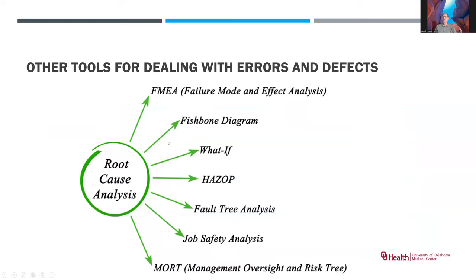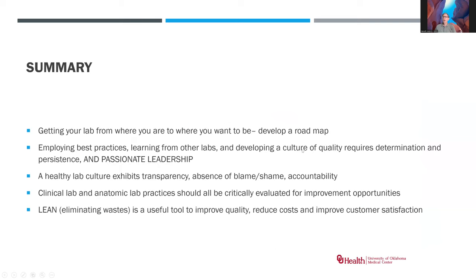Other tools that can help you to do this are failure mode effect analysis, fishbone diagrams, and so forth. These are tools that you can Google or look up or find examples of on the web. I don't want to go into the details at this point.